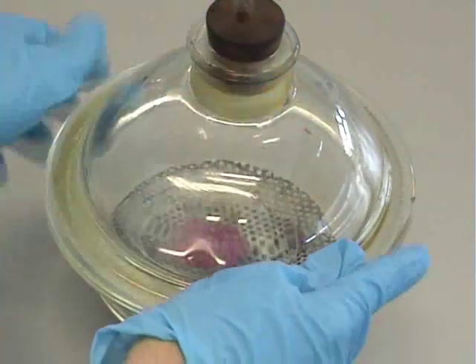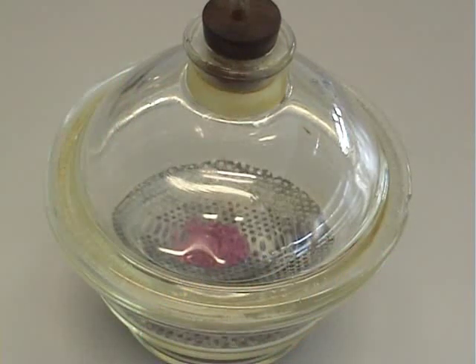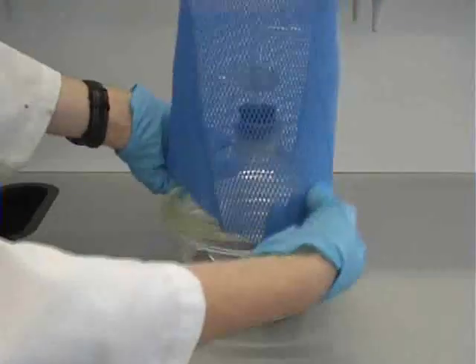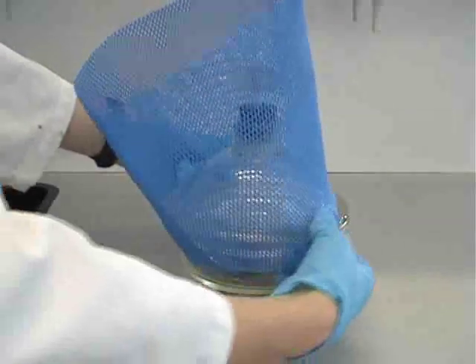The lid is then slid on, ensuring a firm seal, and the blue safety netting is put over the desiccator.